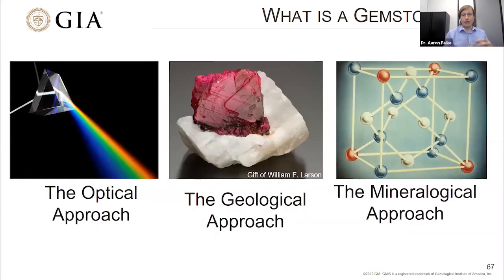And actually, that's kind of where I'm going to wrap this up. I hope you guys have enjoyed taking this behind the scenes tour of the Gemological lab. Like I said, we do a variety of different things, from the almost simple but kind of sophisticated gemological techniques where you're considering the gemstone as an optical device, to considering the gemstone as a geological specimen in order to get some information on what that stone is, if it's natural or if it's laboratory grown, all the way up to dissecting the gemstone at an atomic level in a mineralogical approach in order to get more information about origin and different kinds of treatments. So I'll leave it there.